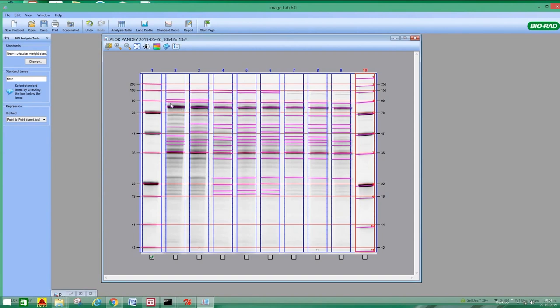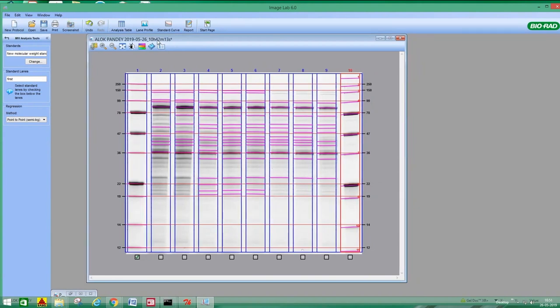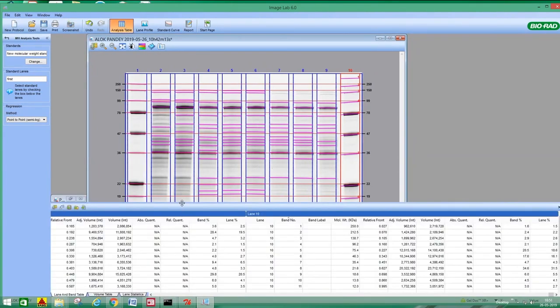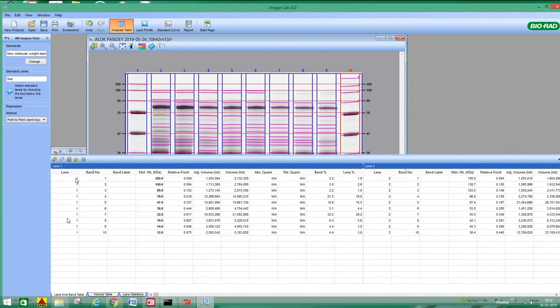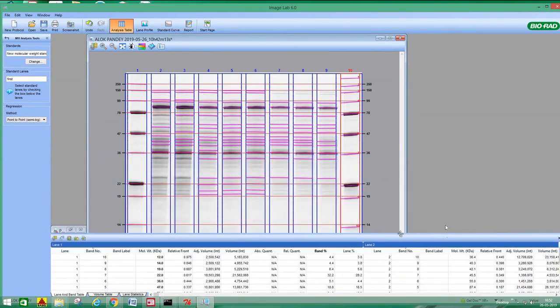So the next thing is, you have to calculate molecular weight of these things. You just need not worry about anything, and you just go to analysis table. So here analysis table, it will give for each and every lane details with proper band percentage and lane percentage. Suppose in first lane, lane 1, it corresponds to molecular weight. See, from lower weight to higher one. So what are the different values? And absolute quantity, this we will see in the next part. And band percentage, how much percentage it is. These things we can see.